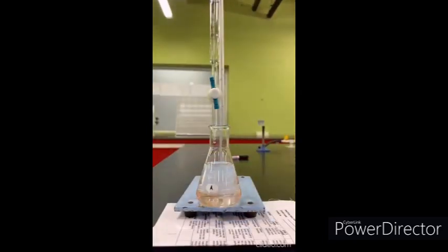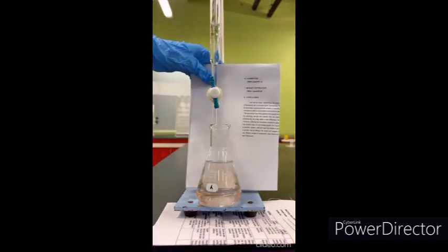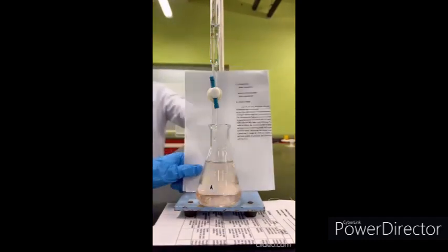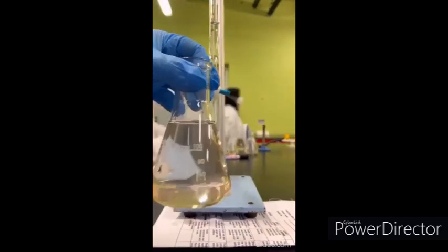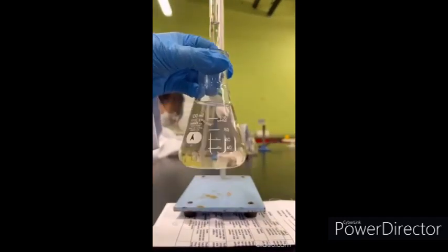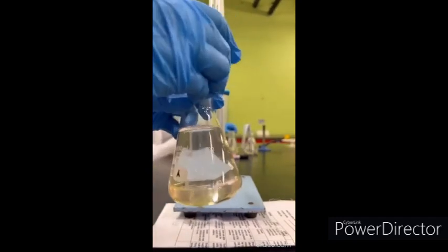At this stage, the solution is getting less acidic and neutral as the onion indicator is changing to colorless. To check the color of the solution, it is checked with white paper. The endpoint is obtained when it changes to slight yellow or green for 30 seconds. Record the final reading of the burette and repeat with the second sample.